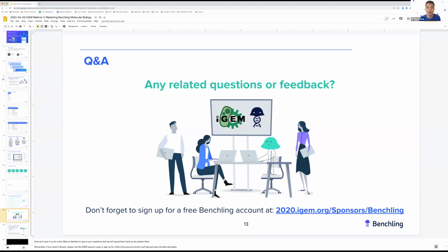Yeah, Sierra, do you want to explain that a little bit more, or is there anything I missed about that? No, yeah, absolutely. Annotations, I didn't have enough time to touch on it today, but basically how they function in Benchling, you can click auto annotate on your annotations tab, and that will source and match every single sequence that you have mapped out in your annotation library to a specific sequence, whatever that might be. If you often use GFP and you would like to indicate it in your constructs, that would be a great example.